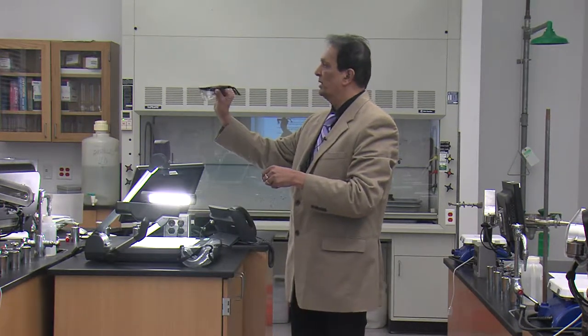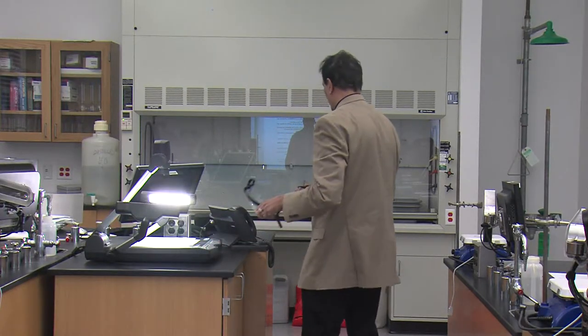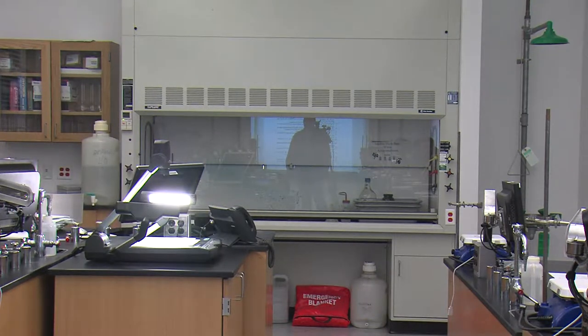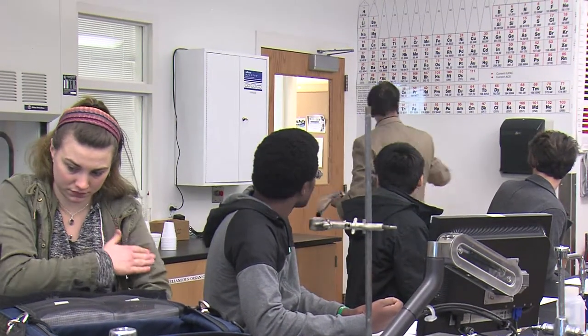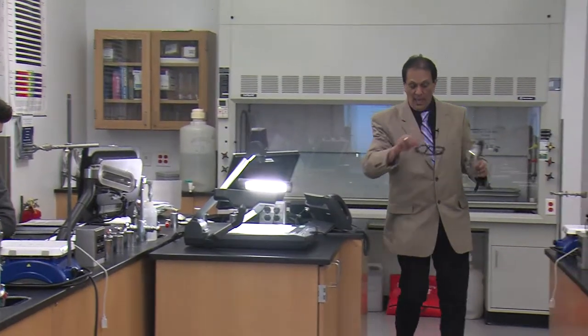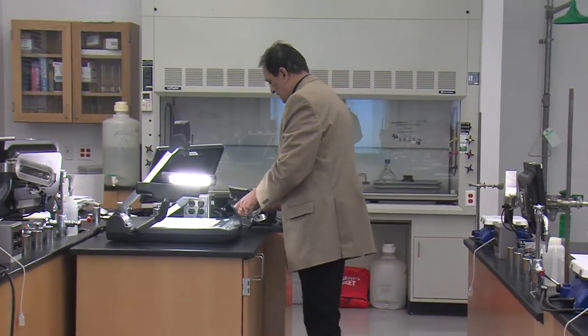Okay, these are disinfected. We will provide these to you. These are disinfected and we store them over here. We have a UV lamp, and you may come and grab one from here. If they are smudged for any reason, you can take paper towels from here or from the dispenser over there. You can wet the paper towel and wipe them clean. All right, so that is number six.